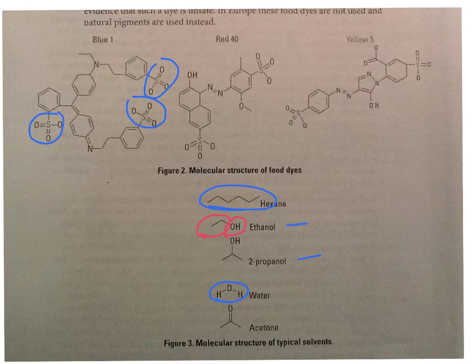And in these molecules here, a large majority of these molecules, this right here would be more hydrophobic. So this would be more water hating right here and right here. Okay, in these areas here. So it would make sense that we would see decent separation with these two compounds because it's got properties of both.